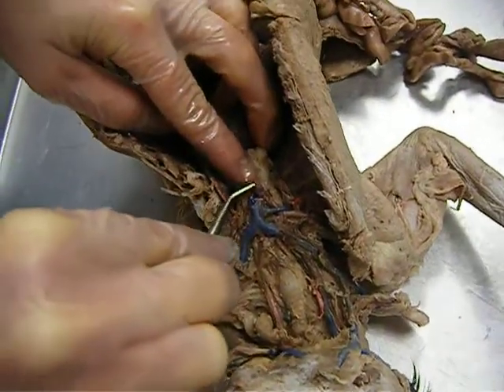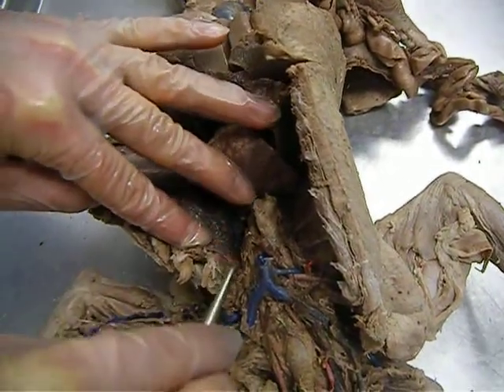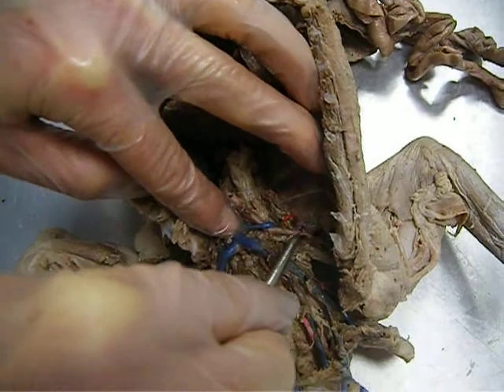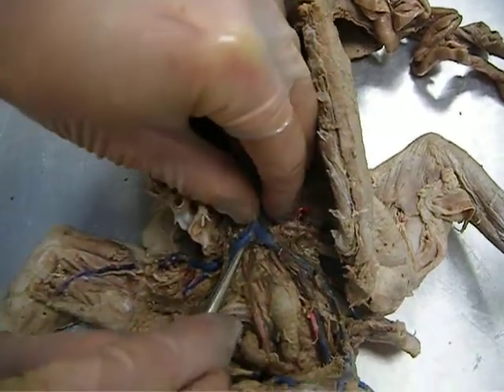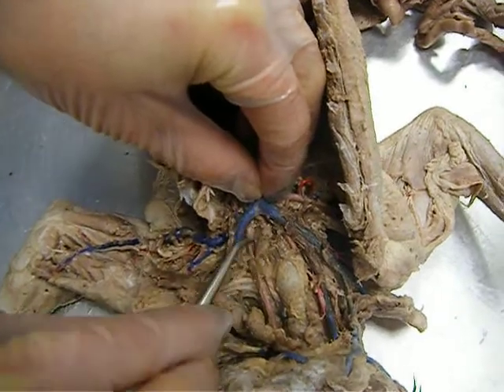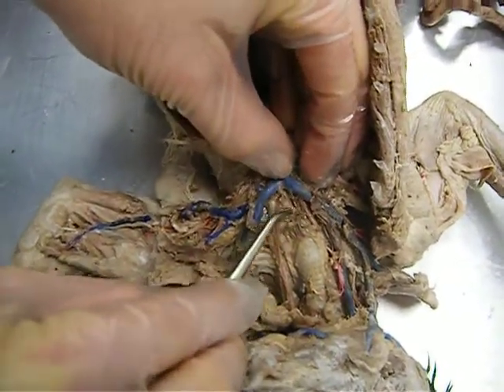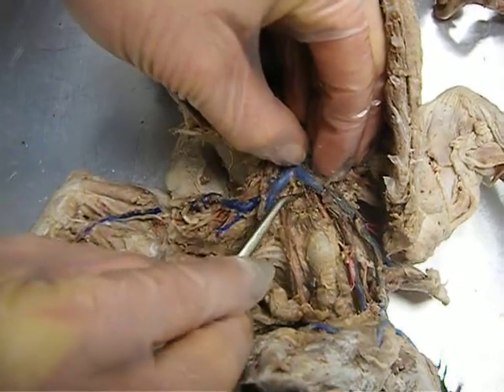The arteries, we have our brachiocephalic artery, and this little guy is your left subclavian artery. This guy over here is the right subclavian artery. The brachiocephalic artery branches into the two carotid arteries. The carotid artery goes up. You should have a little cranial thyroid artery right there.